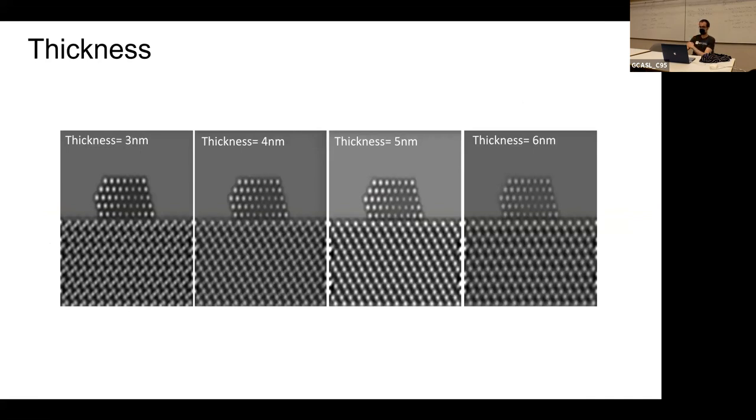Is the important thing how things are oriented in the bottom support, like the different ones, diagonal? That's to show you how, with different thicknesses, it's kind of weird, right? Because if you're taking a picture and something has different thickness, you don't care. But in this case, because this is about electron scattering and quantum effects, it actually produces quite a big difference in what you end up seeing. In terms of what they really care about in this particular case, it is the atomic structure of this thing. That's what they really, really care about. But still, they would want to recover everything as well as possible.